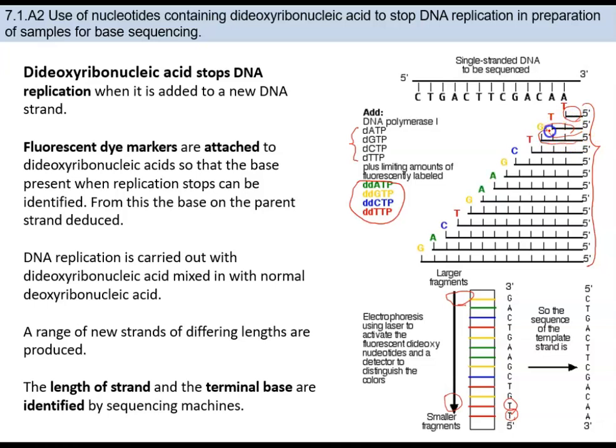TTG, and the next one is G, TT, then G, and the next one again you can see is T. So based on the size of the fragment, it goes step by step down, and the one that is lighter goes to the bottom, and the one which is the heaviest, which is G, as you can see, the fragment is the heaviest one, so it will be at the top. Let's read these together.